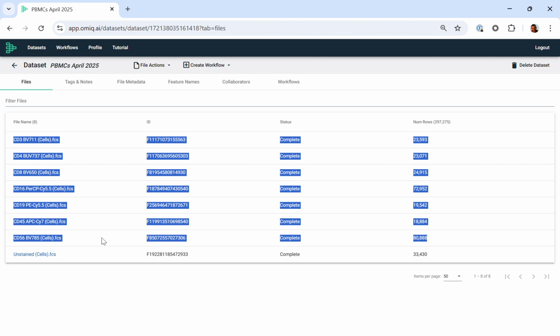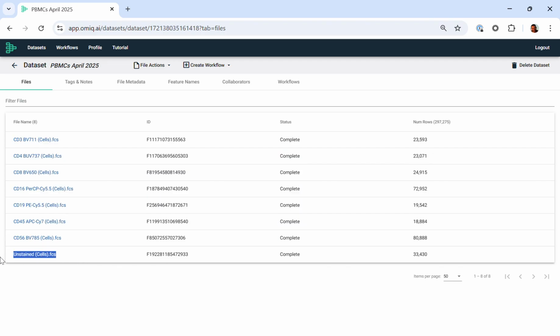The second purpose is essentially to build optimized and relevant panels accounting for your autofluorescence spectral signature or signatures, which is critical and important, especially if you're working on tumors and co-cultures and so on. Again, we'll chat about that in a second, but these have been long awaited and highly requested features that we're very happy to release just today.